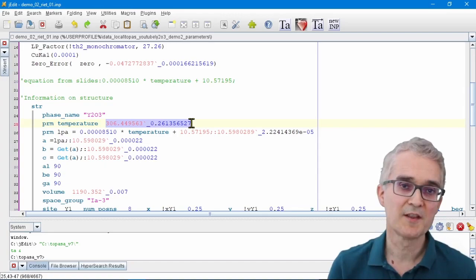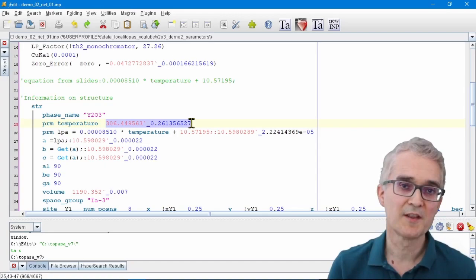So there are lots of other tricks like this you can do with TOPAS. And the real power comes from being able to write your own equations into the software and defining your own parameters to extract from the data. So hopefully that will give you some inspiration for doing your own types of unusual data analysis.